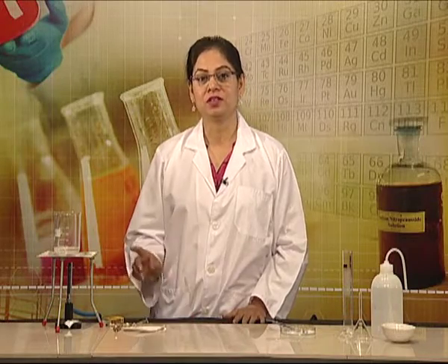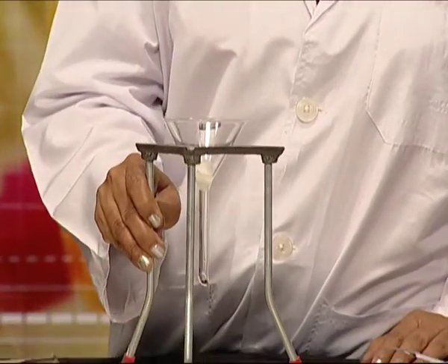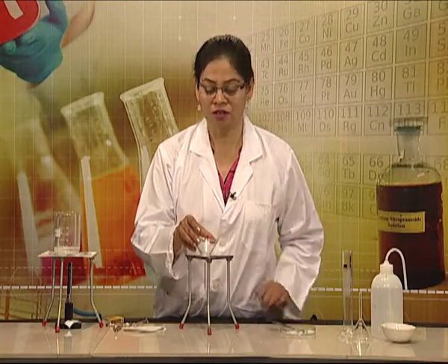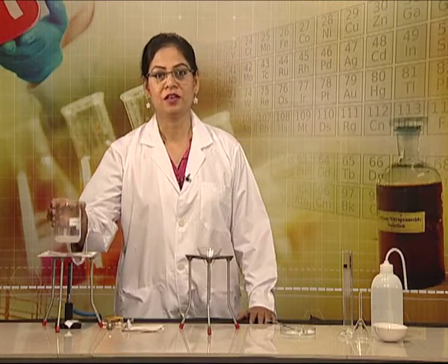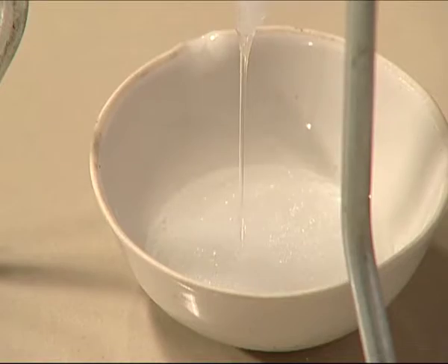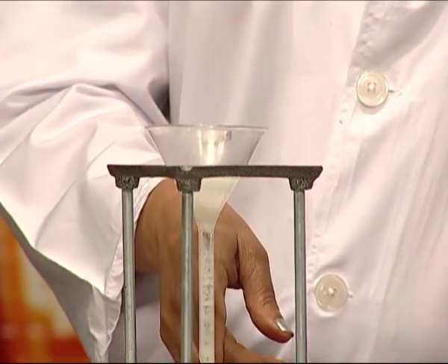Now, we will filter this saturated solution with the help of a glass funnel and tripod stand, and some small cotton is inserted inside the funnel. It will help in the filtration process. Now, transfer the filtrate into a porcelain dish, so that insoluble impurities will be collected on the cotton and soluble impurities will go inside the filtrate.